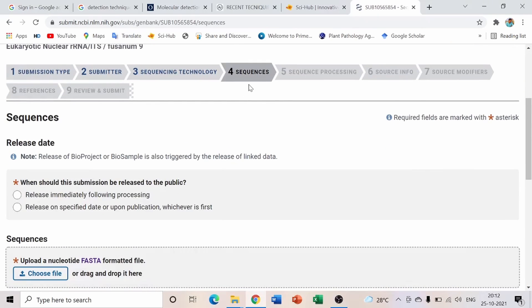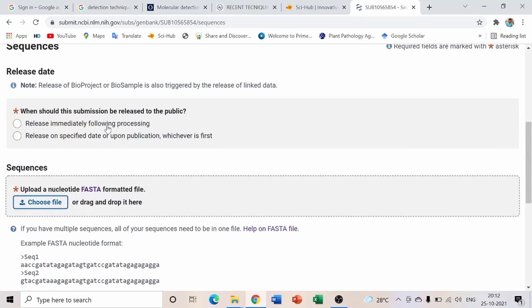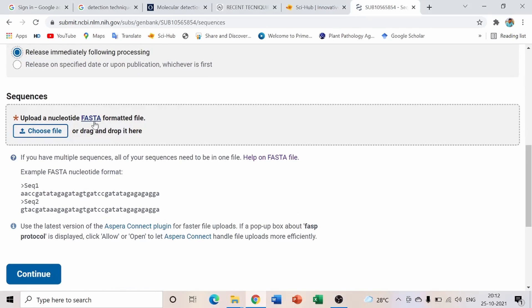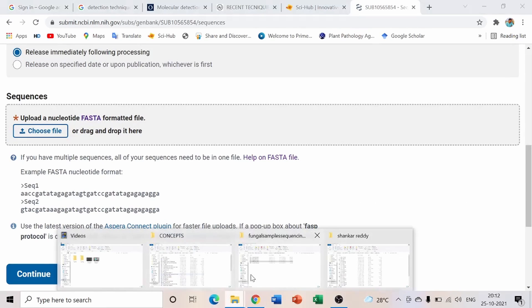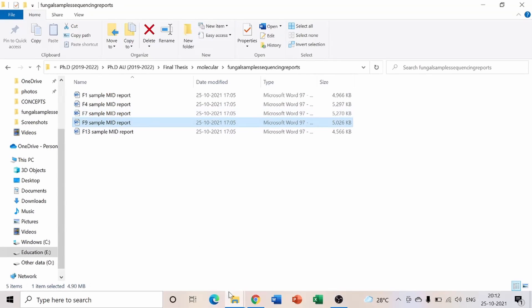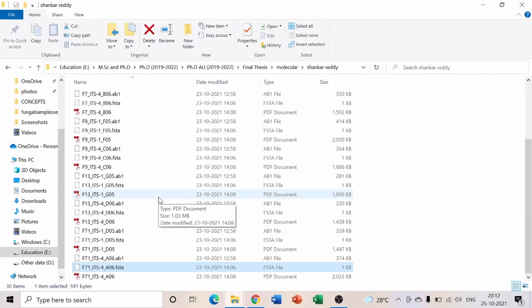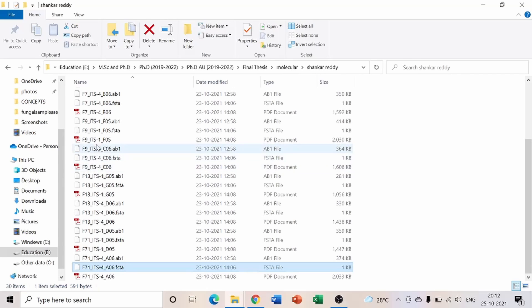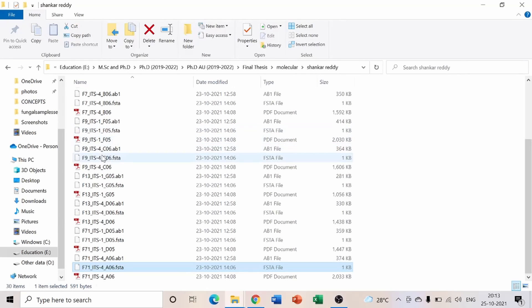On the Sequences page, set the release option to 'Release Immediately Following Processing' for immediate publication. I will now upload the FASTA format file for isolate F9 — the ITS1 FASTA file for the ninth isolate.